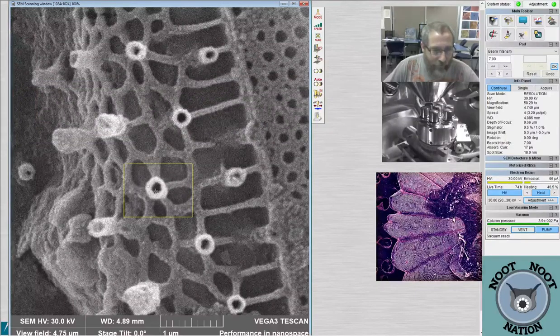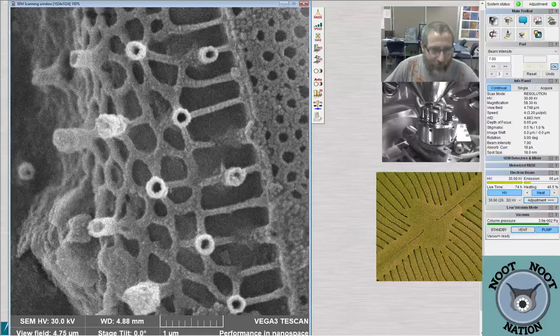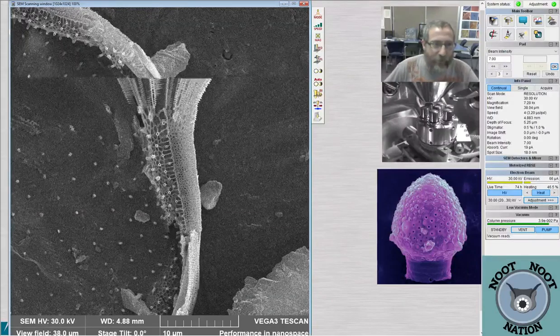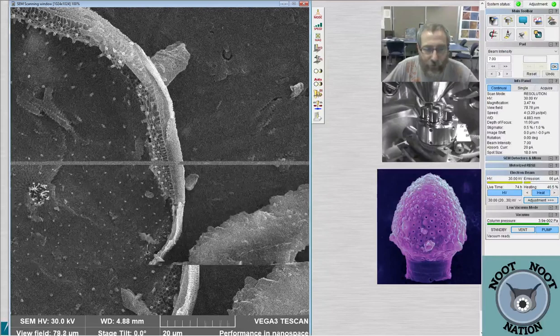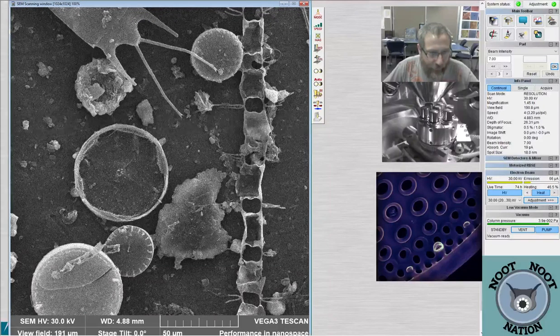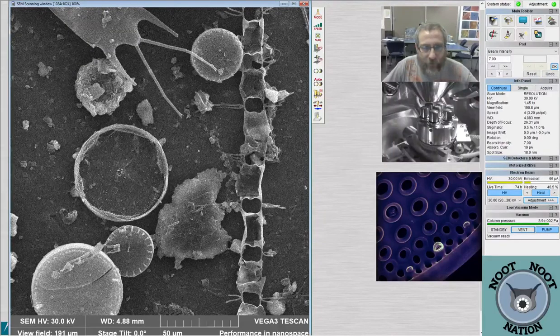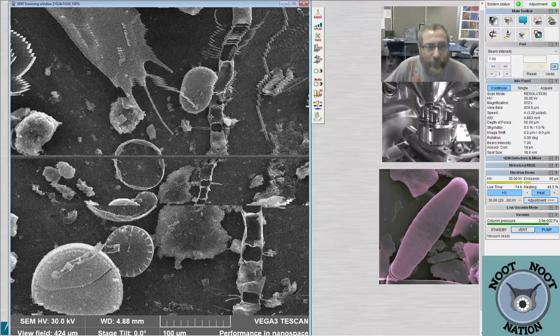And for many species of round diatoms, they usually squeeze some goo out of these as well, and they use them to create sort of a parachute-like structure or little threads that stick outward from the valve to baffle their descent so they don't fall through the water quite as quickly. And I believe this down here is Thalassiosira pacifica, which is here in the subset. And then this thing over here that you're seeing that looks like a long colony is Chaetoceros.